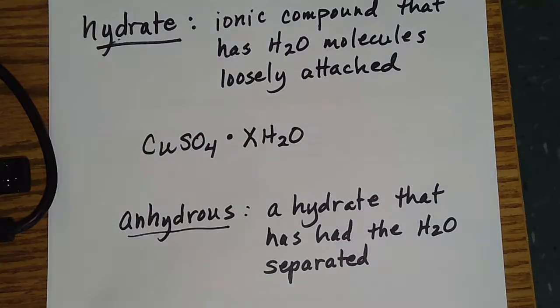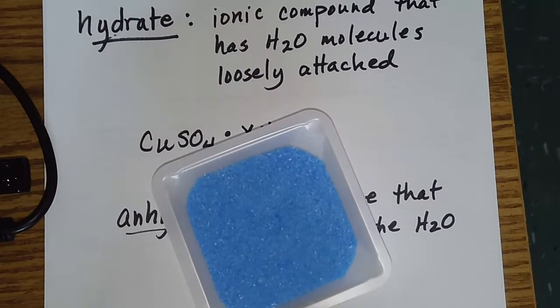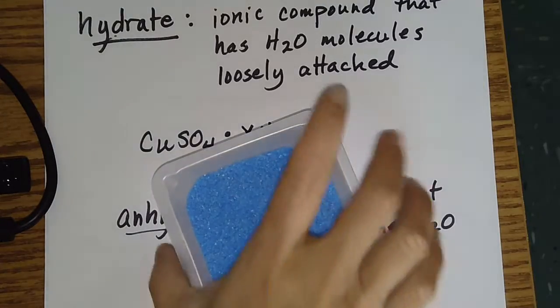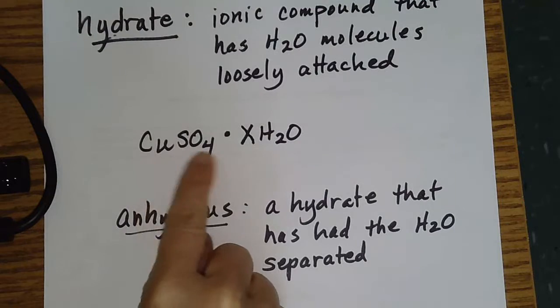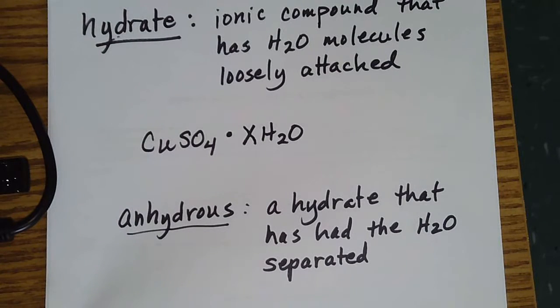Exactly. So we're going to get the mass at the very beginning before we have evaporated the water. So you're going to put some of this inside of what we call a crucible to heat it up. And then the water is going to evaporate away. And then we'll have left over at the end just copper 2 sulfate without the water. So anhydrous copper 2 sulfate. How can we get the mass of the water, of just the water? Yes, sir. Or subtracting the anhydrous copper sulfate from the original.